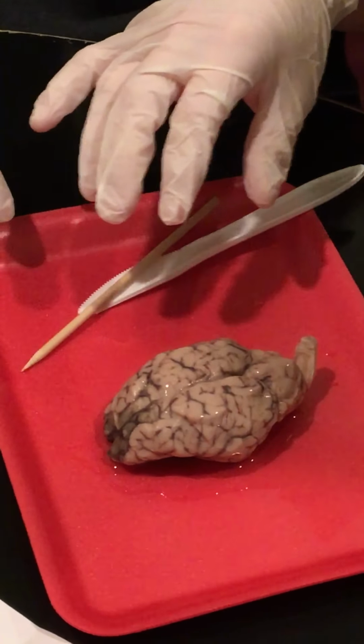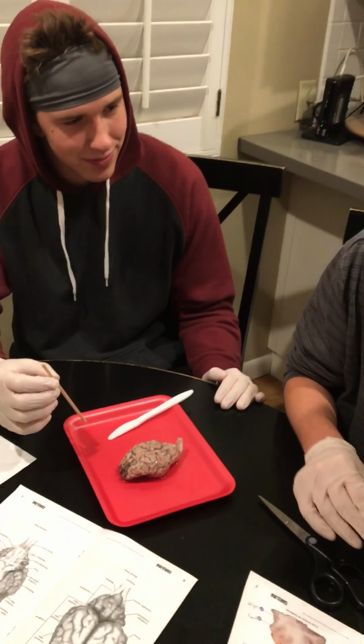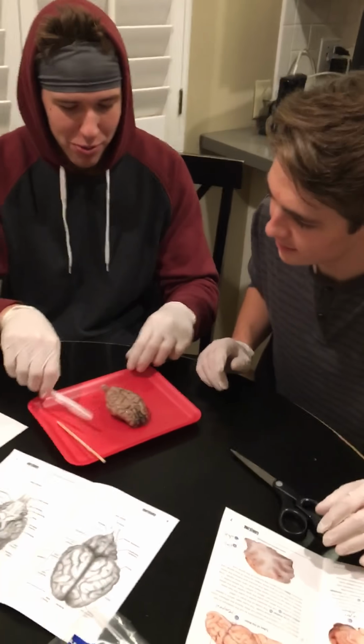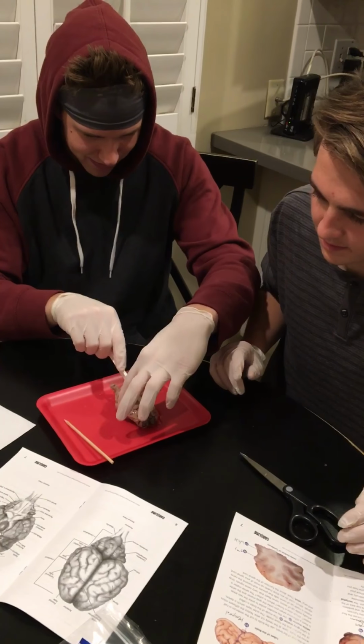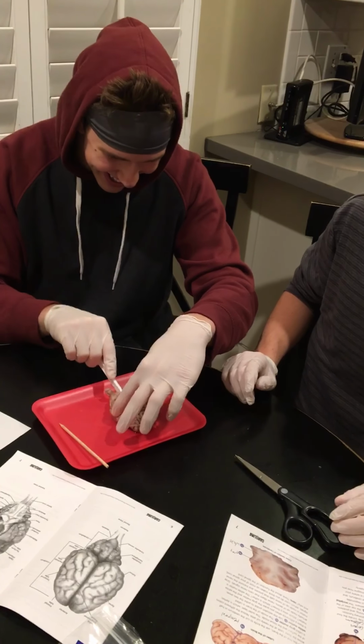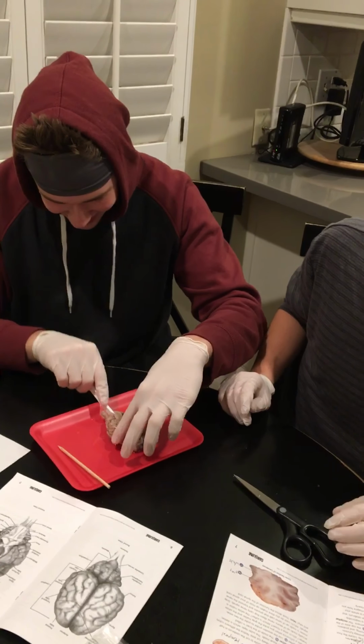All right, I think from here, should we cut this baby open? I think we should give it a cut. Yeah, when you want to do the honors. I will cut her right open, if you don't mind. Kind of like cutting chicken. Right down the middle.